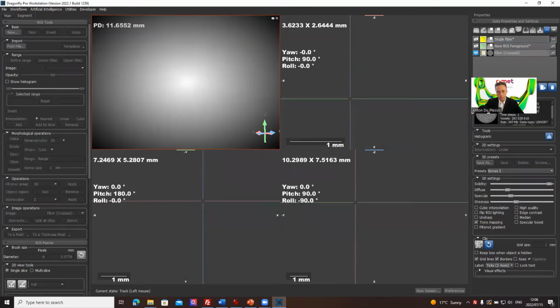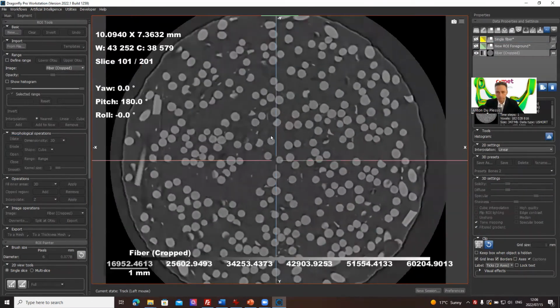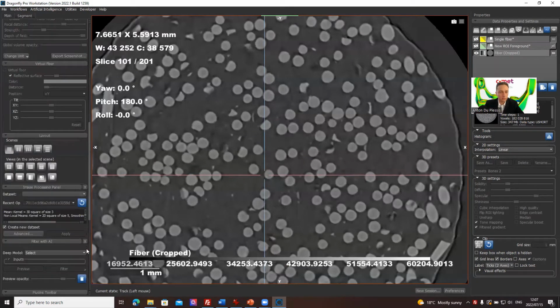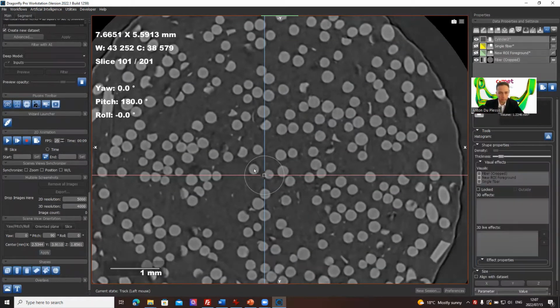Let's go back to the data, and what I want to demonstrate further is cylinder function unwrapping. Not the best data for that example, but this was part of the training, and I'm reproducing the training order and everything done during the training. The software is really big and there's a lot that can be covered, so we hope we've decided on the best coverage of the topics of interest.